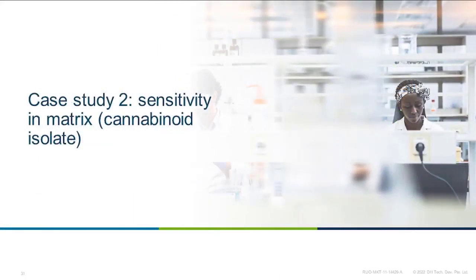So next, let's talk about the sensitivity. So we know we're going to need sensitivity for a method if we're going to be analyzing these trace levels.